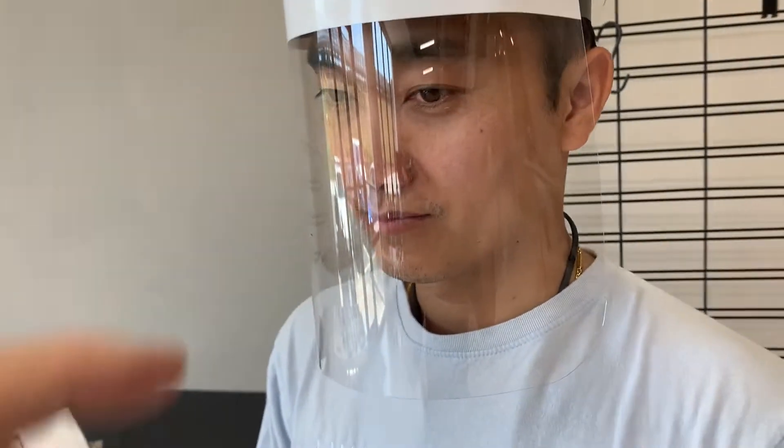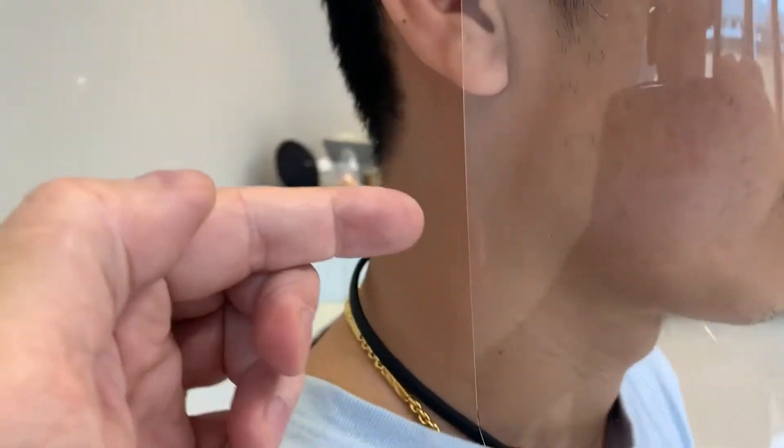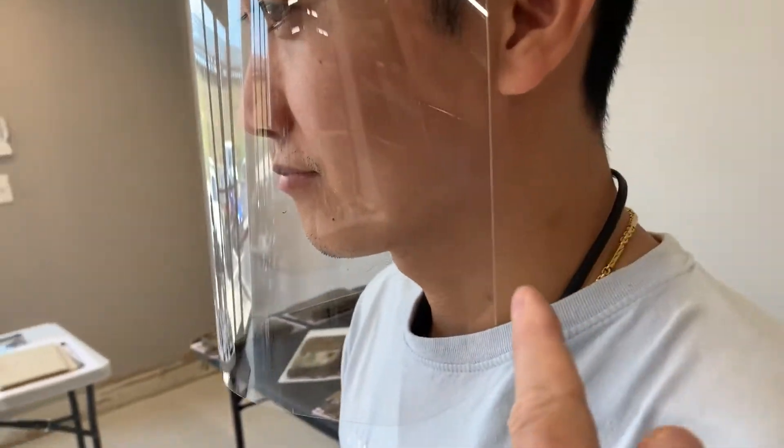The mask comes down 9 inches and it goes all the way around to the ear. From here to here is exactly 13 inches.